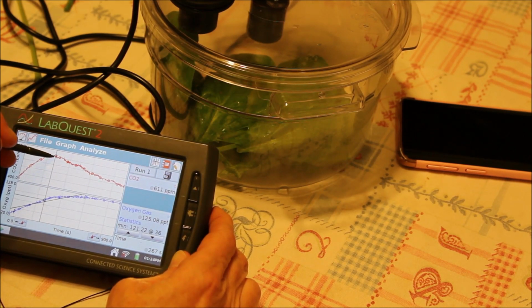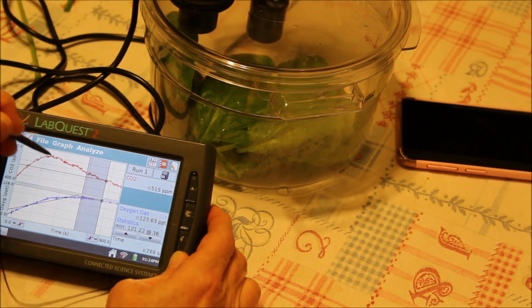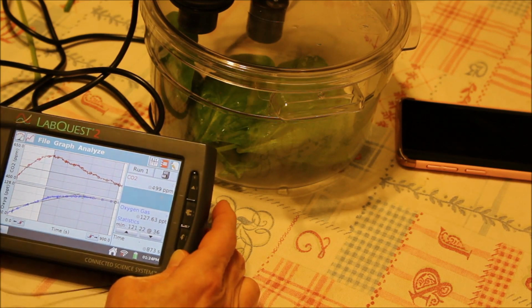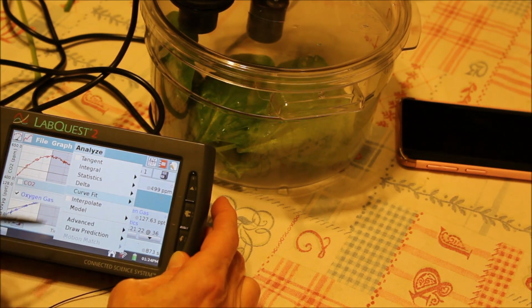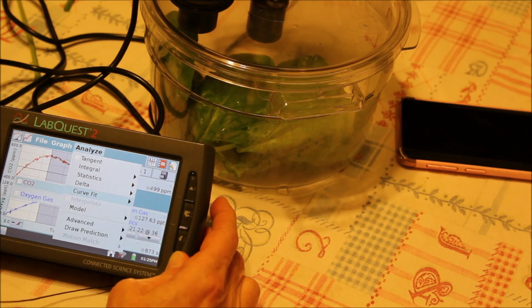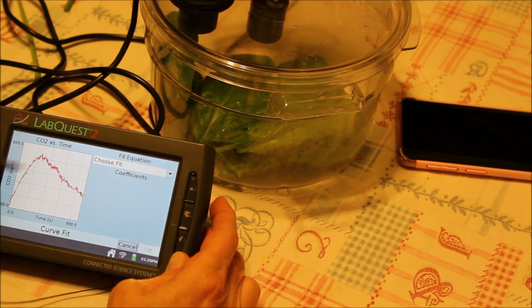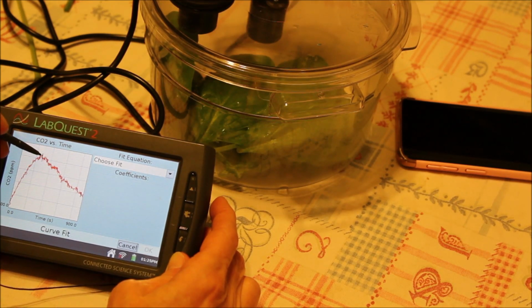But from here, I hold the cursor and pull it all the way down. I will press analyze and you will do curve fit. In the curve fit, you will X the oxygen out, and you will not have any problem with that. You will X the carbon dioxide at this point. Now it gives you a little bit of a shot in here.